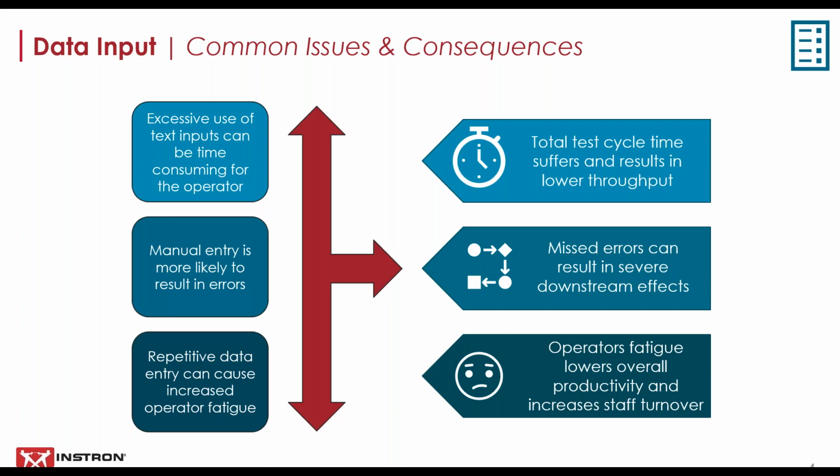The total test cycle time includes data entry, specimen insertion, actually running the test, and specimen removal. Just for an example, let's imagine a test on a brittle material, which may only take 20 seconds, while the actual data entry associated with that test may take 30 seconds, putting in all the different operator inputs. If you're able to reduce the data entry time to just 5 seconds, over the course of an entire year, you could test almost 30% more specimens.